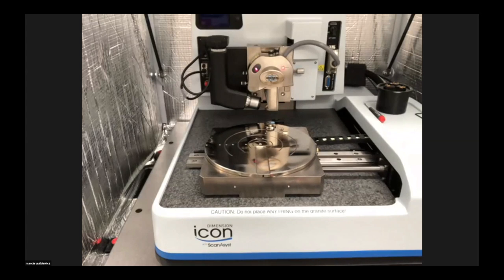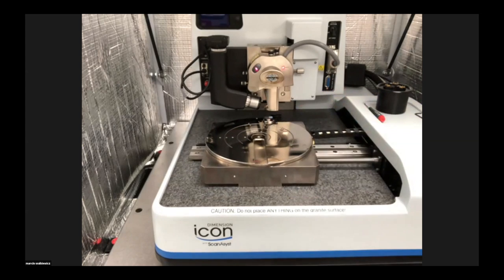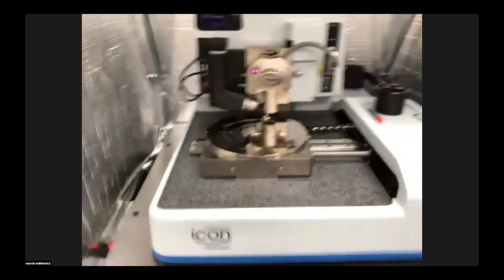So my tip is mounted at the bottom of that device. This is a scanner that's actually going to be moving the tip up and down and scanning it over the surface. So we need to get within 1 millimeter. All right, I'm going to move this thing back a little bit, and then I'm going to share the screen from the actual instrument.